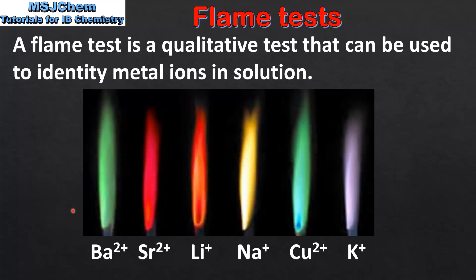As we can see, the different metal ions give different colors when heated in the flame. From left to right we have barium, strontium, lithium, sodium, copper and potassium. These colors can be used to identify the metal ions in solution.